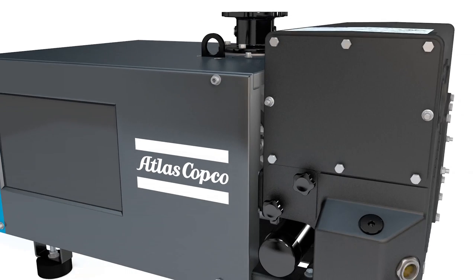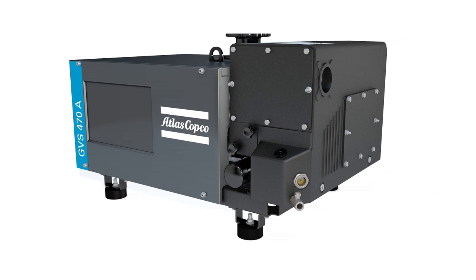The GVS A-Series, rotary vane vacuum pumps that ensure peace of mind with years of faithful service.